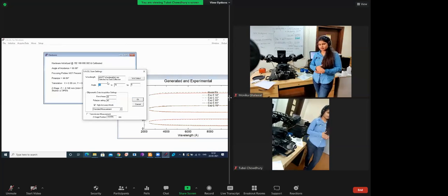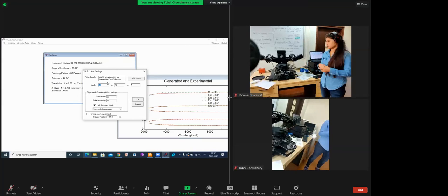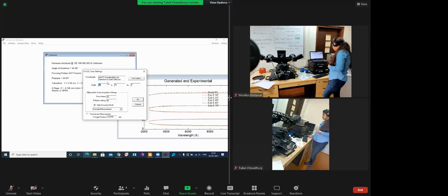So I will assign the angle according to the silicon dioxide and tungsten mixture, the pseudo Brewster angle, as we generally call it. I will go for 55 to 70 or 75. The step size will be 5. You can take 1 or whatever you want. So I will go for 5.